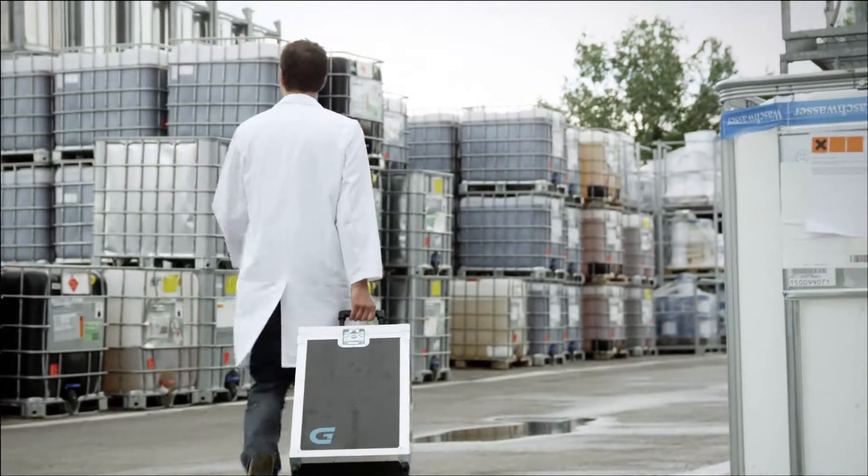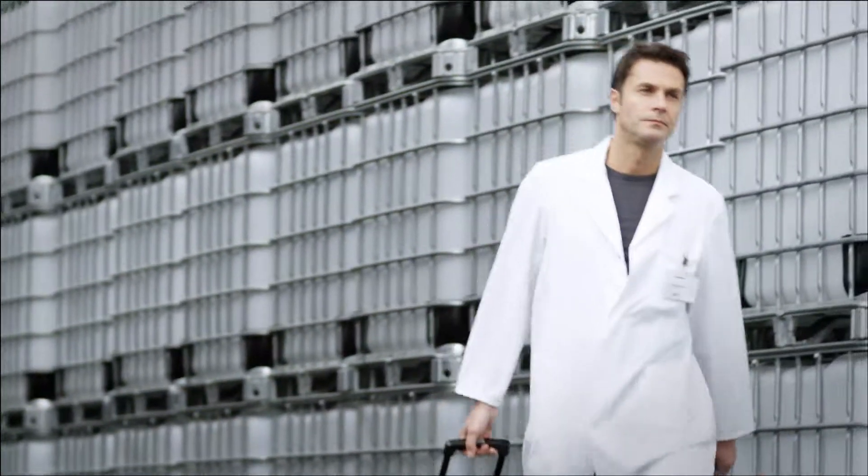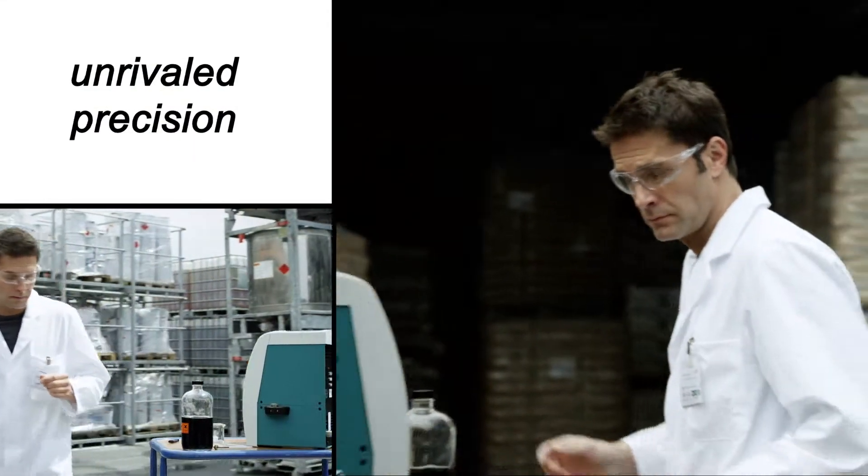Precision is also essential here at Rambert & Coatings. So we use the Minivap VP Expert to test the vapor pressure of our products with unrivaled precision.